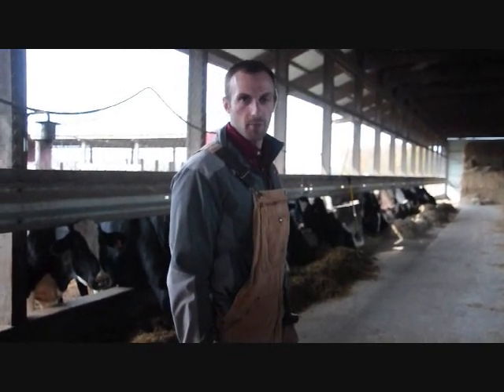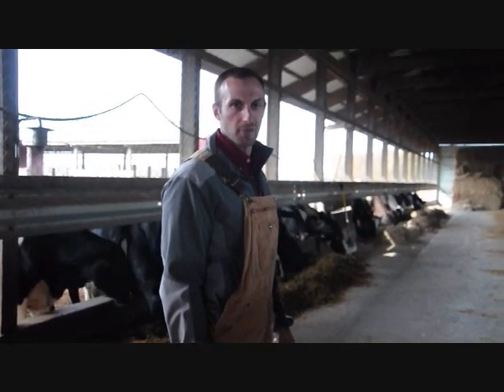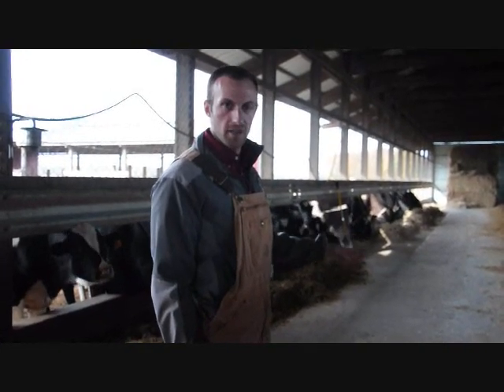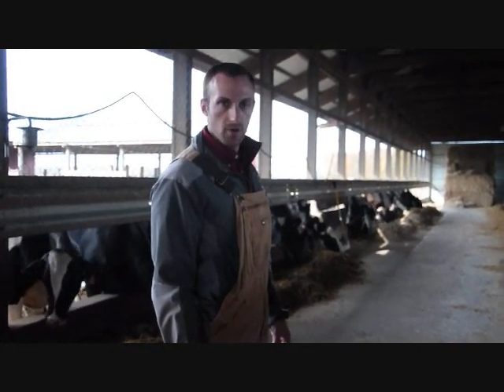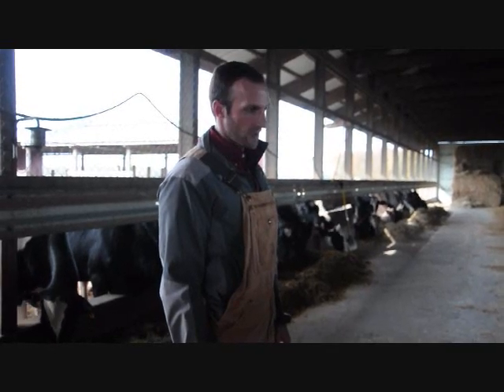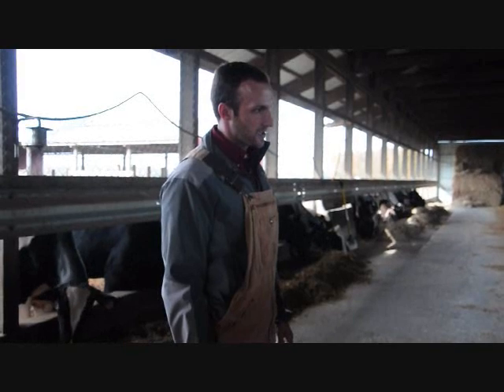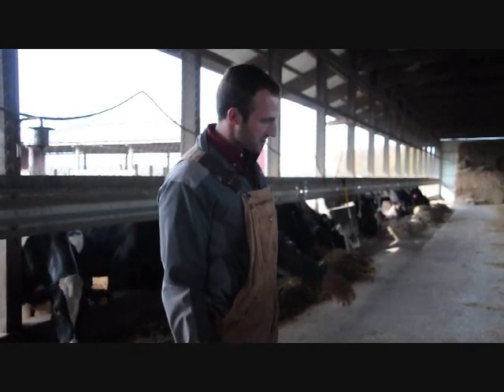Good morning or good afternoon depending on when you're watching. This is John Gazer with Rock River Laboratory. Today we're going to go through taking a TMR or feed sample and taking corresponding manure samples for an analytical test such as TMR digestibility or fecal starch. We're going to go through that today in detail.